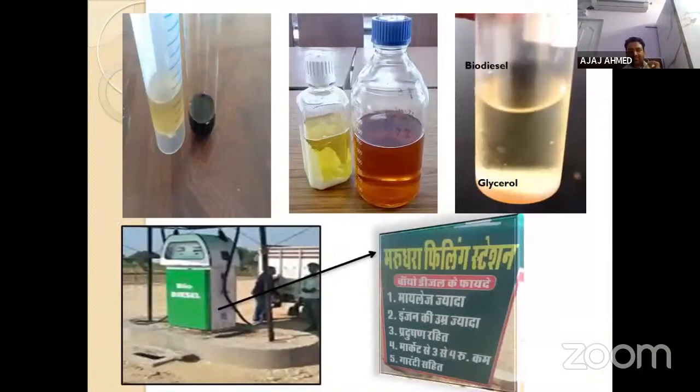Some pictures are shown. The first picture shows separated glycerol and separated biodiesel, and the second, the yellow bottle, is a commercial biodiesel. The next one is biodiesel made by me, and the third one is biodiesel and glycerol.